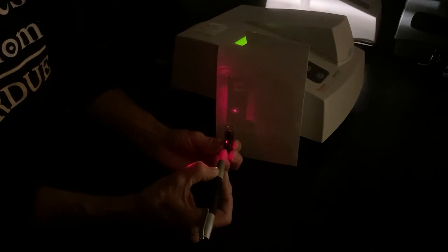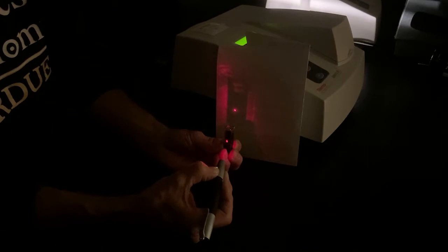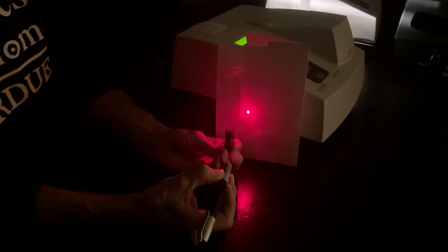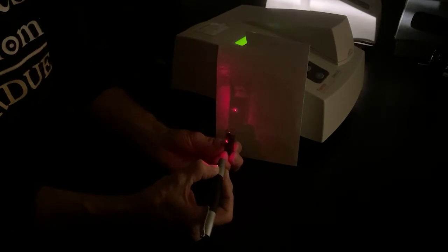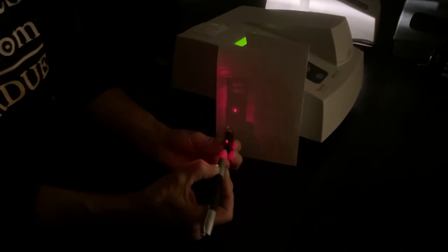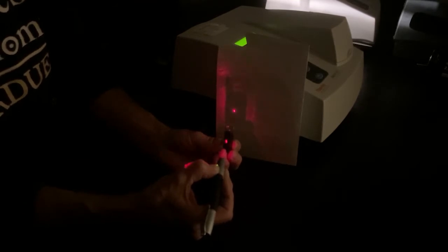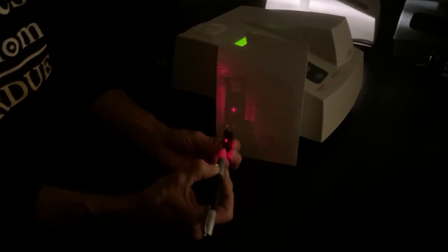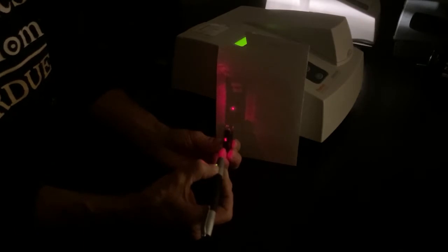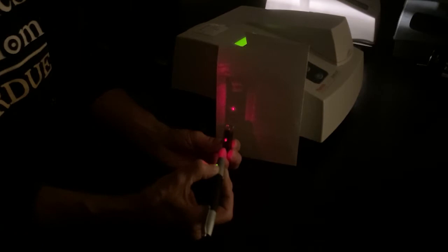So, that's what you were talking about earlier when we were looking at the one that was dividing all the light. In this machine, it's going to use something like that to divide the light so it's only shooting a certain color through? Yes. So, if we have a solution, let's say our green solution. If we were analyzing something for green, think about a common material in nature. Oh, chlorophyll, right? Sure. Chlorophyll in leaves. So, we could extract chlorophyll from leaves. And there are different kinds of chlorophylls. Some are green. Some are red. Some are yellow.